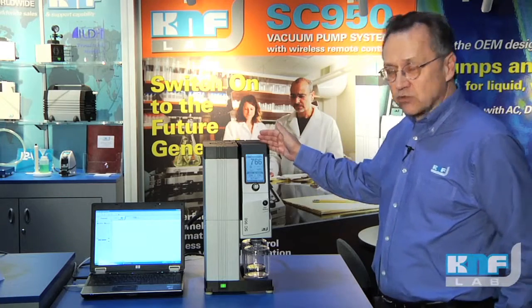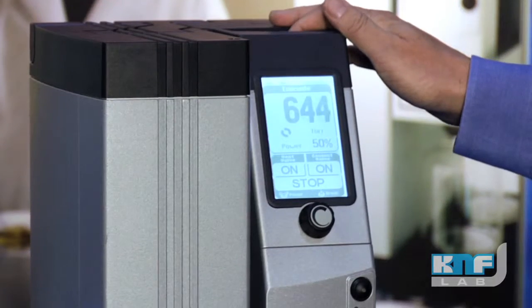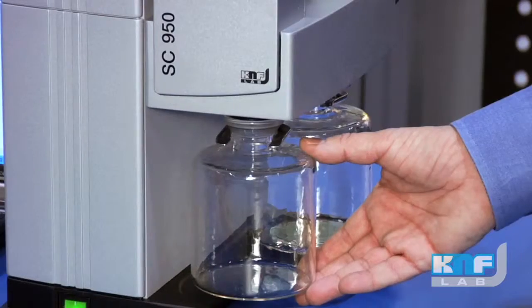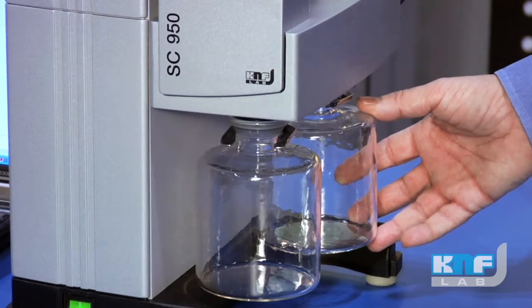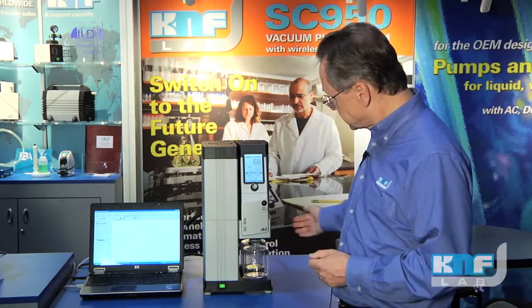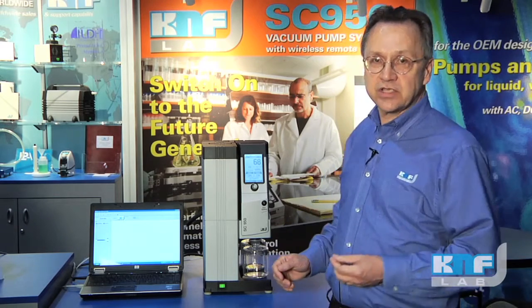If we take a look at the product, you'll notice a very small footprint and quiet operation, making it easy to integrate into your lab seamlessly. The solvent recovery happens through the inlet separator and the outlet condenser. Any wet vapors coming in from your process will fall out into the inlet separator. If they start to recondense during the pumping process, the outlet condenser will trap the solvents there as well, guaranteeing almost 100% complete recovery of the solvent.